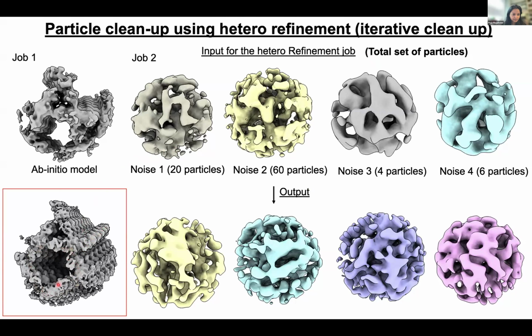Now I will go through the filament structure that we found from this map in a step-by-step fashion. What we observed is that Cat1 dimers stack on top of each other, forming this filament assembly, and the filament is glued by the CA4 signal molecule in the middle, shown in yellow. The dimeric CARF domain forms the center of the filament, which is the sensor domain for this defense system, and the TIR domains, which are the effectors, are radially arranged.